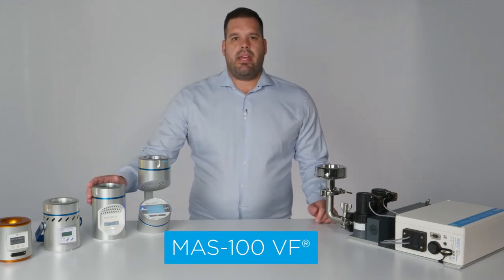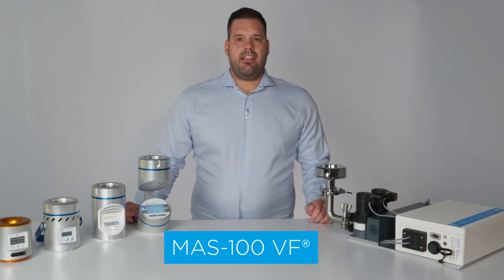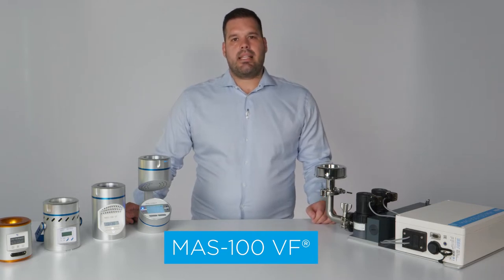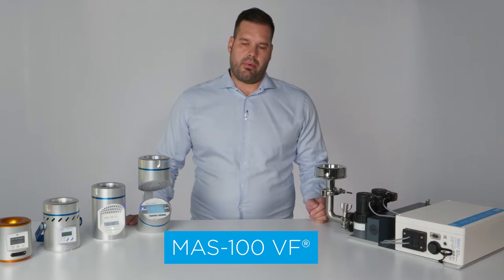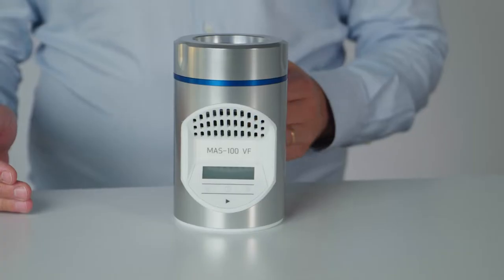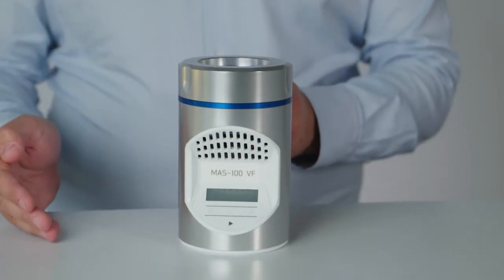The MAS-100 VF is one of the most popular microbial air samplers. It is used for viable air monitoring in clean rooms and other controlled environments. In this clip I will present you all the features and capabilities of this powerful product. My name is Andy and I will present you the MAS-100 VF. The MAS-100 VF is a portable impaction-based viable air sampler.